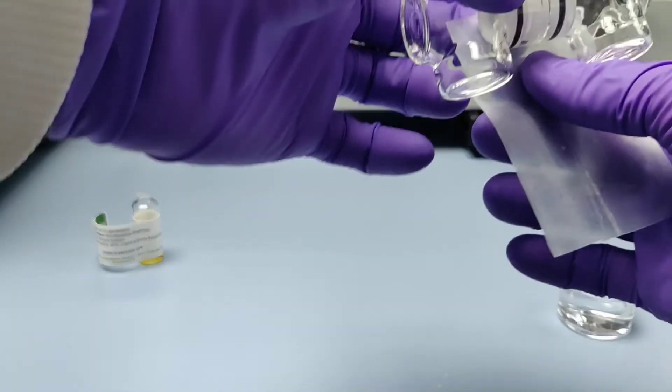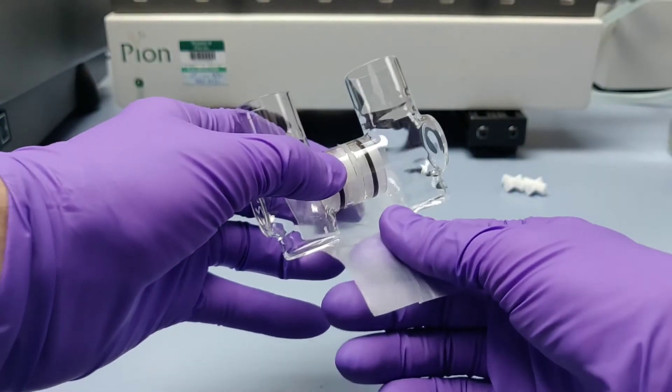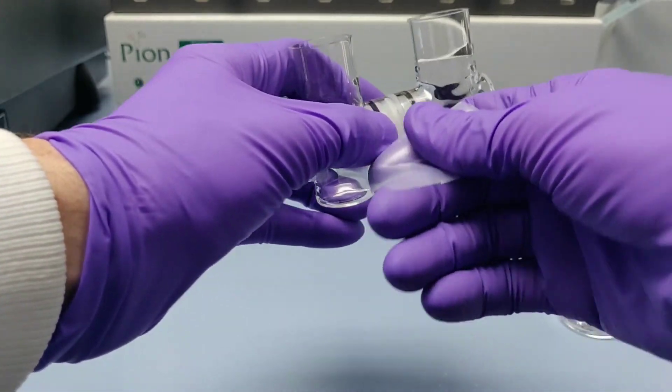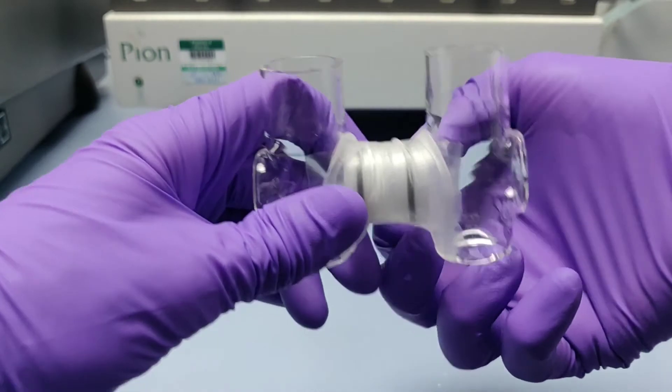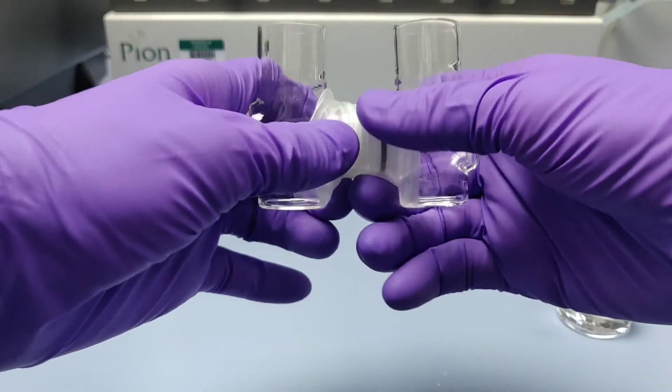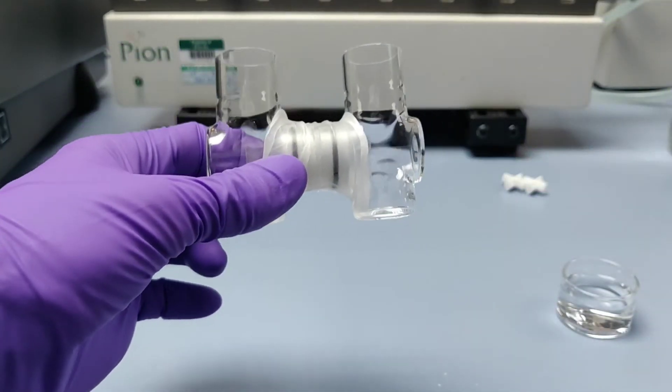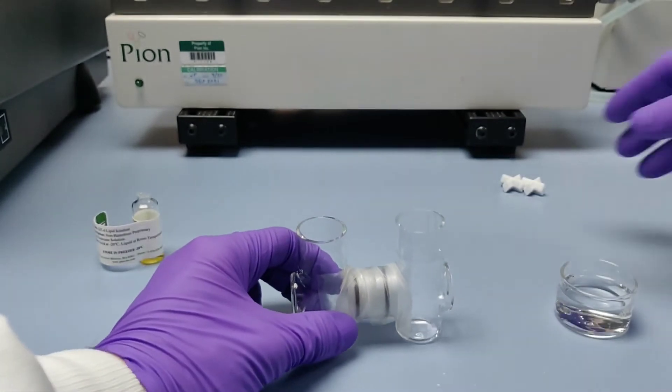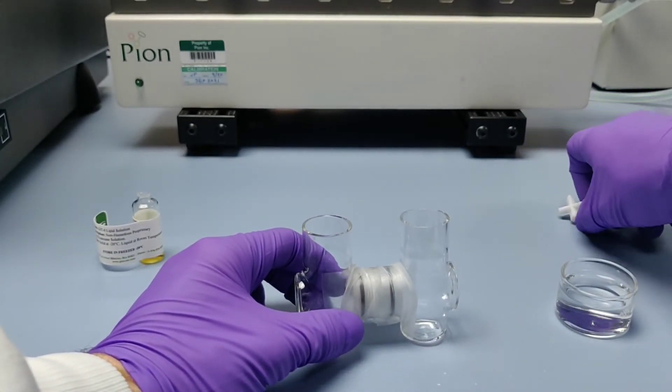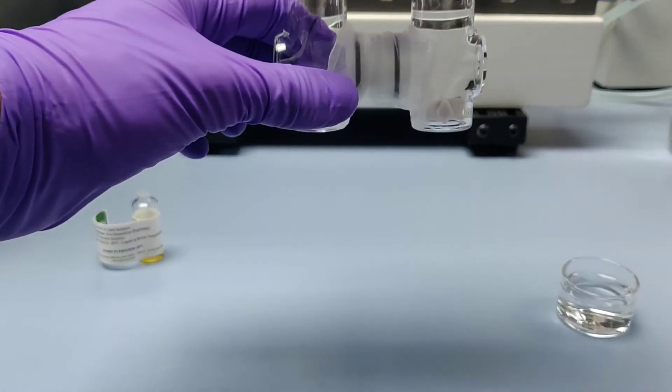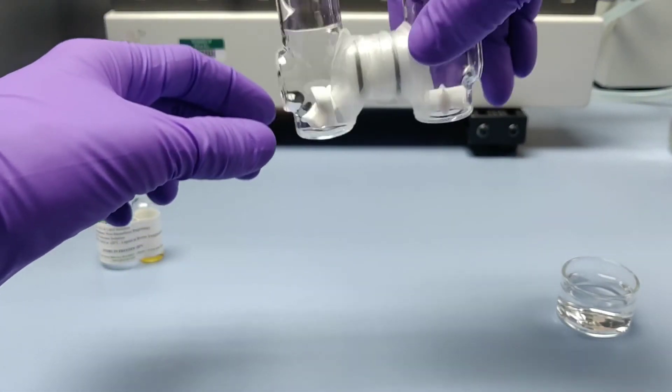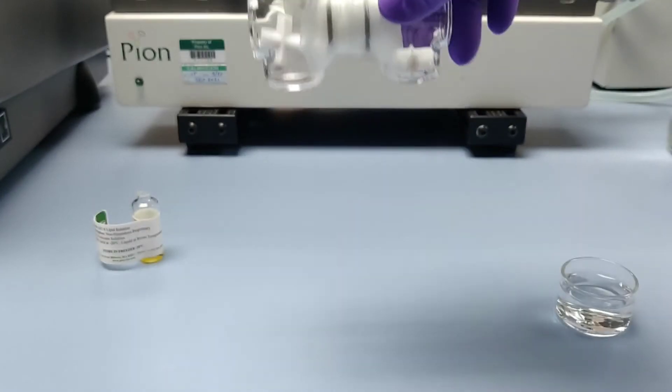Finally, the join between the two halves can be wrapped in parafilm to ensure against any leakage. A cross-stir bar is placed into each chamber, and the donor and acceptor chambers are filled with the relevant media.